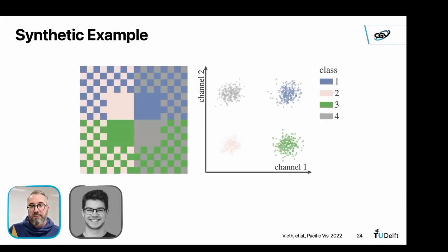Right, so here's a very simple example of how this would look. This is our actual data. It's just two-dimensional data, not very high-dimensional, right? But just for illustration, we see that we basically have these four groups of pixels. We put a bit of noise on this, so it's a nice Gaussian distribution so that we don't run into bad numerical issues. But essentially now, every pixel is colored with the color that we assigned here.